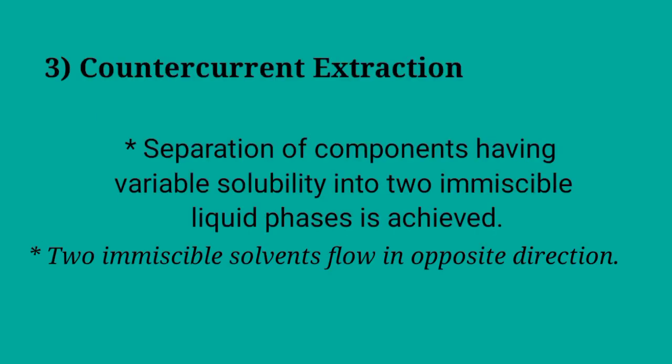Countercurrent extraction. In this method, separation of components having variable solubilities in two immiscible liquids is achieved. In this method, two immiscible solvents flow in opposite directions in continuous contact with each other, with a resultant separation of solute.